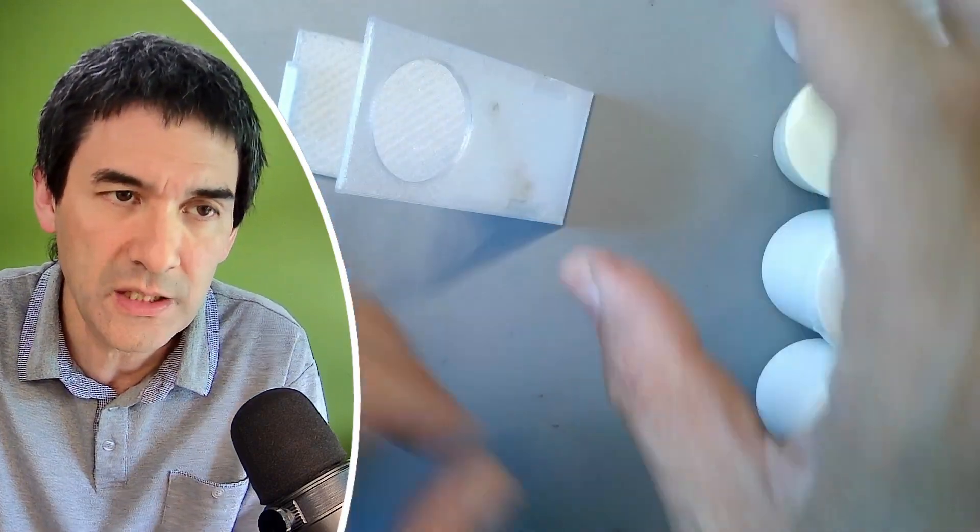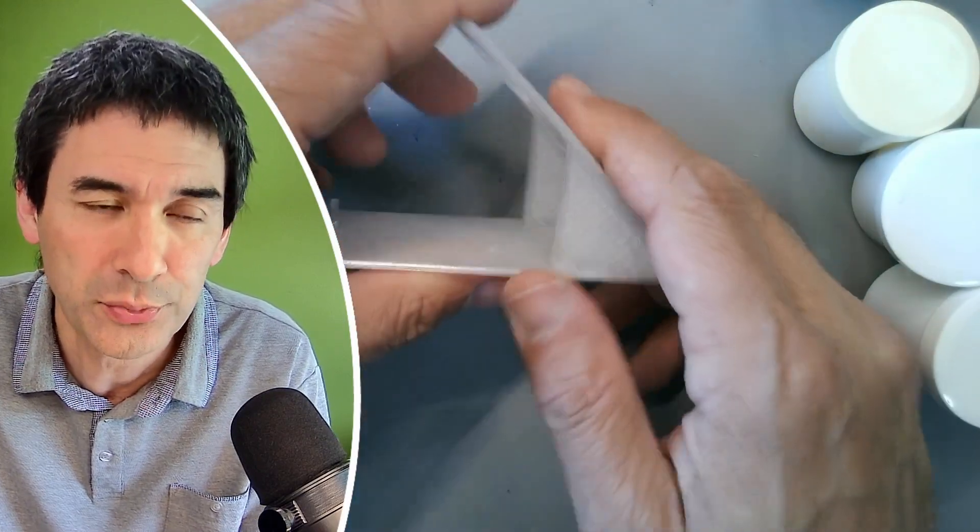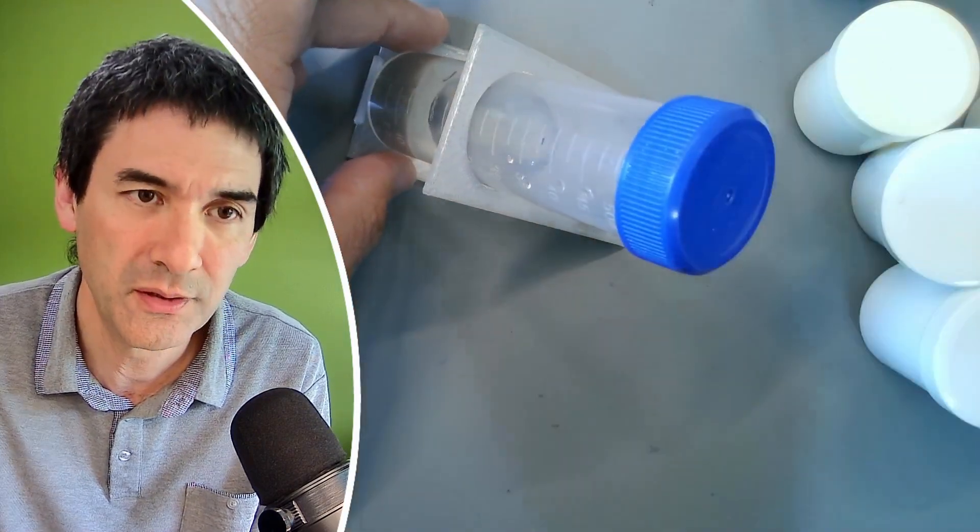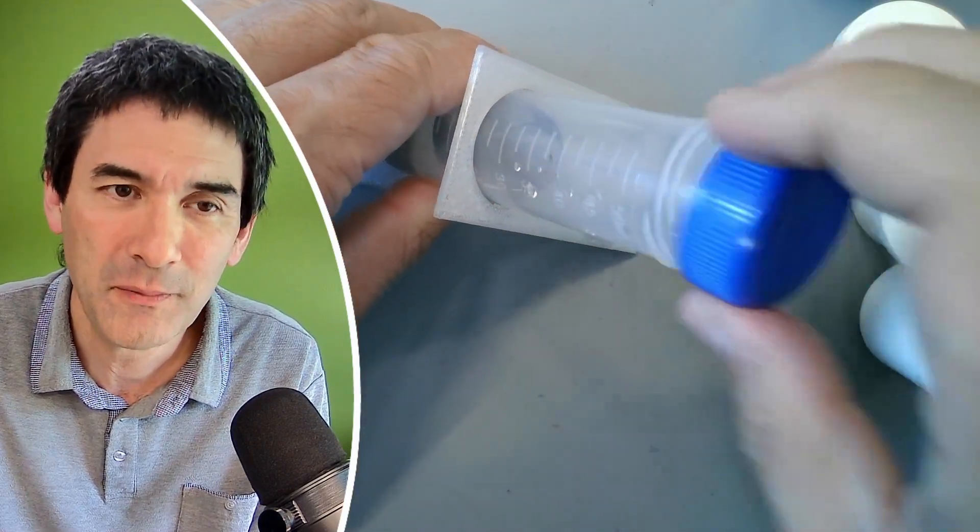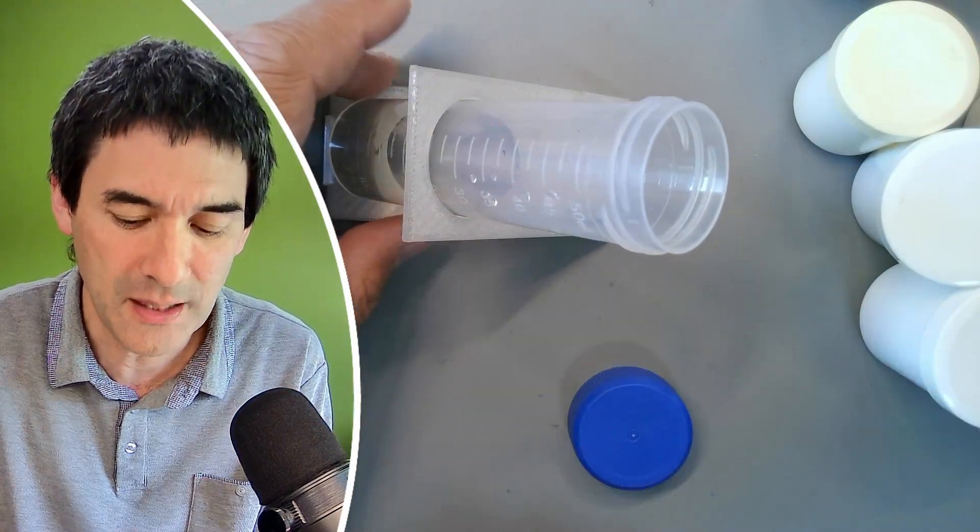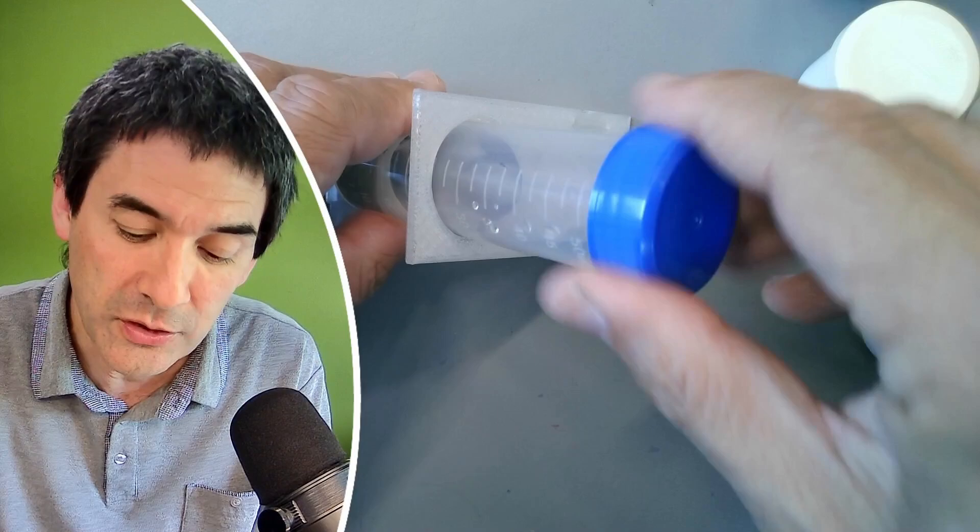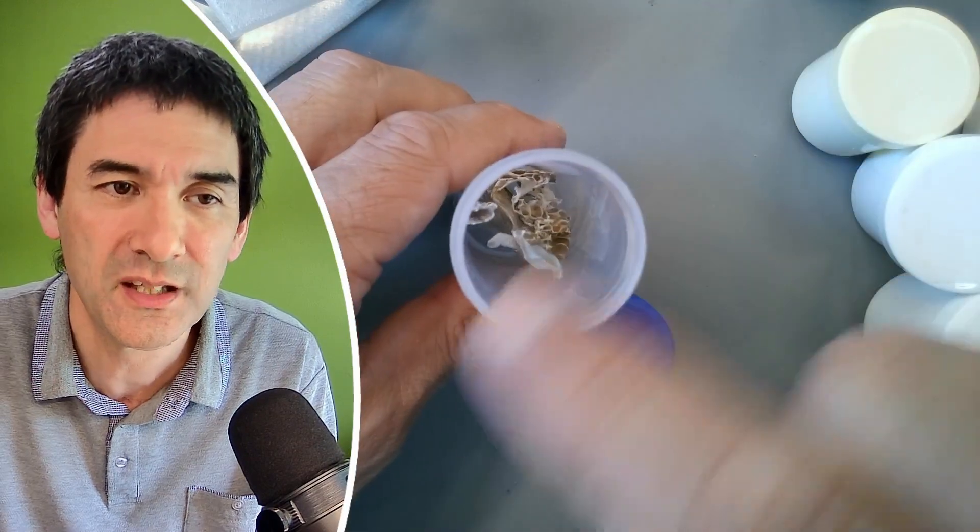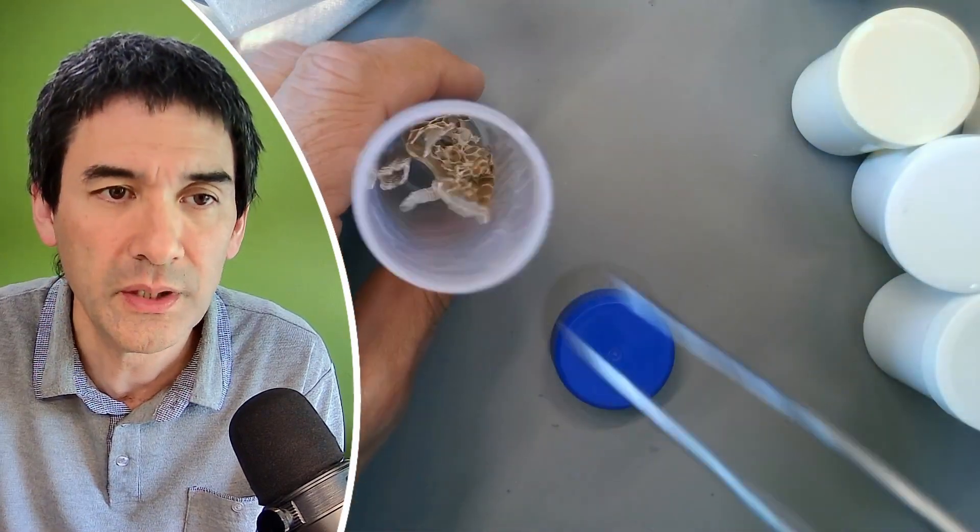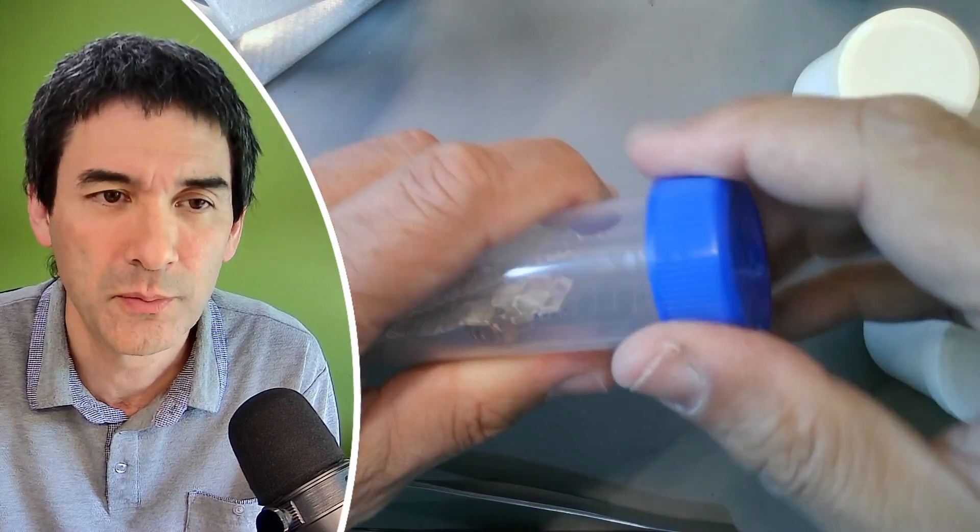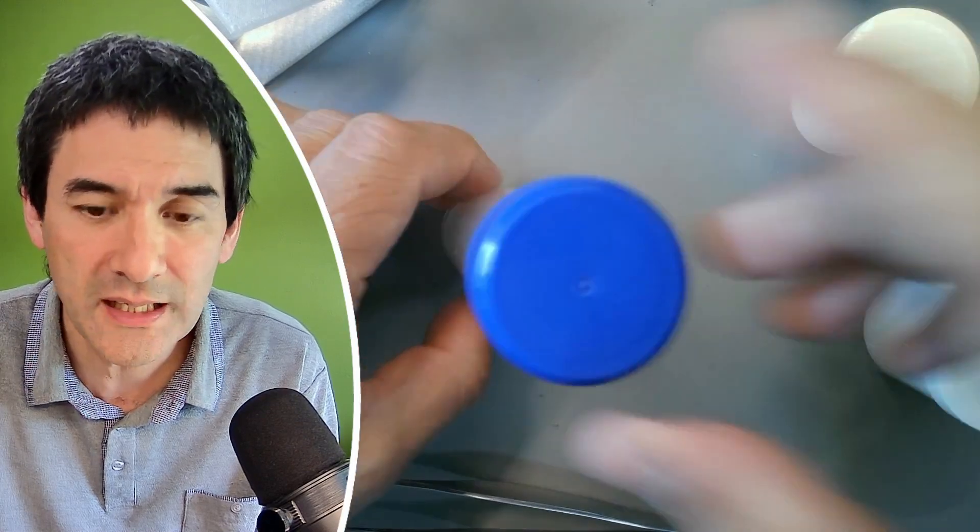Something that you've also seen already before because I do have a 3D printer I like to also print my own tools. I've made myself this little holder so what I can do is I can just put the tube in here and then it's much easier for me to use a pipette to take out the samples. I'm not only using those for water samples but look at this what I got here this is some snake skin that you can also put in here and because it's a little bit wider you can actually go in with the tweezers much more easily.